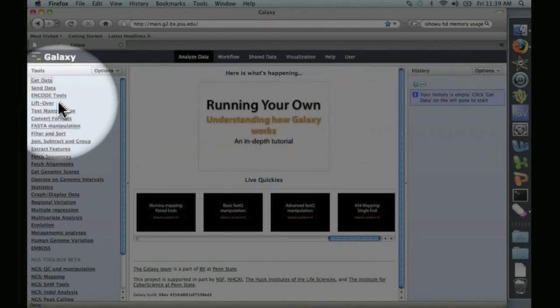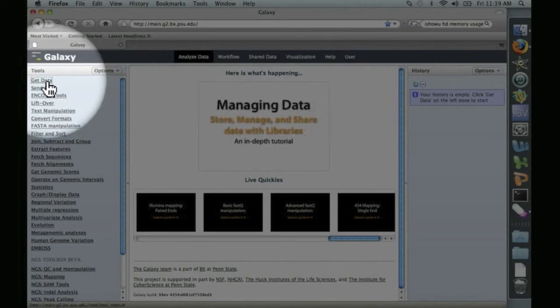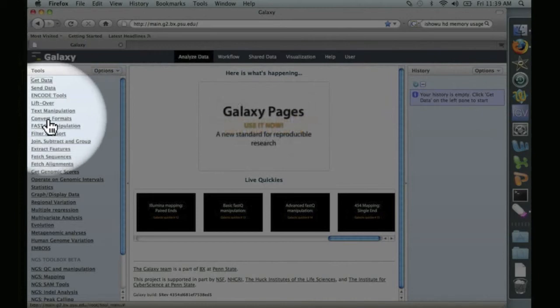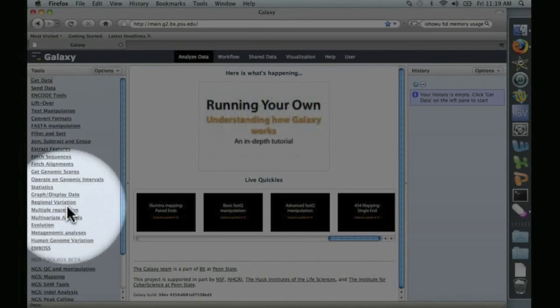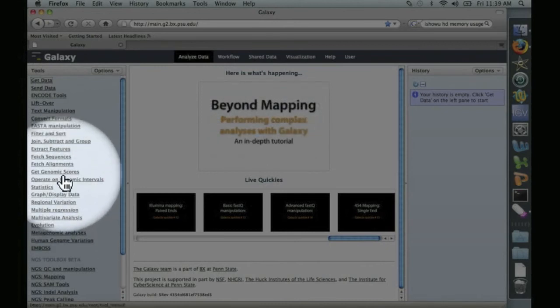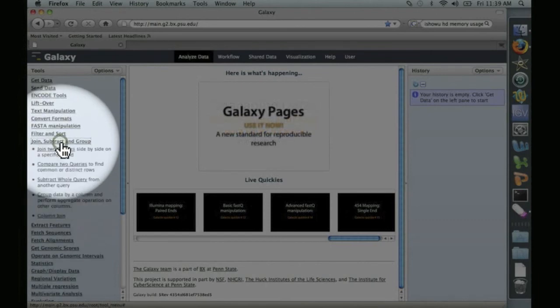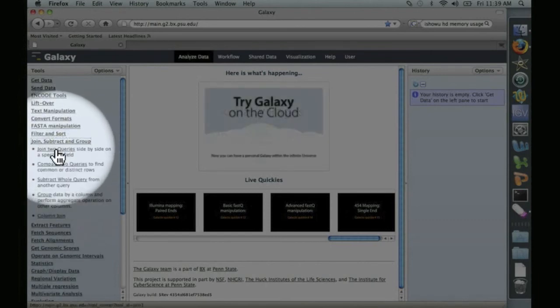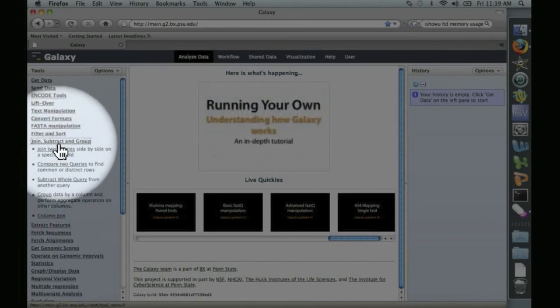Over here on the left is the list of tools that Galaxy has available, starting with get data and including things like filtering, statistics, multiple regression analysis, etc. And if we click on one of these, like join, subtract, and group, you can see that under this heading there are a variety of specific tools.